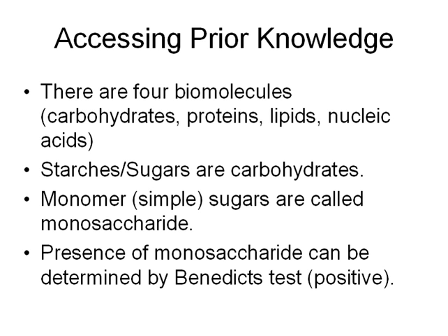Simple sugars like glucose, galactose, fructose, those are all considered to be monosaccharides or simple sugars. Those are monomers. So what we're looking at here is we can determine the presence of monosaccharides by using a Benedict's test, and mainly it'll be positive for a Benedict's test. Okay.